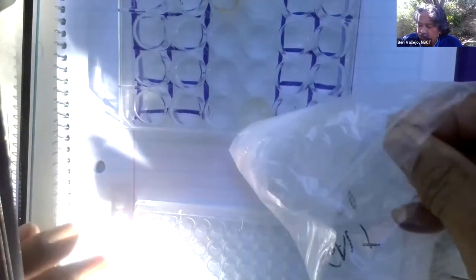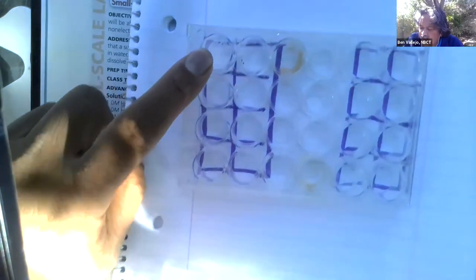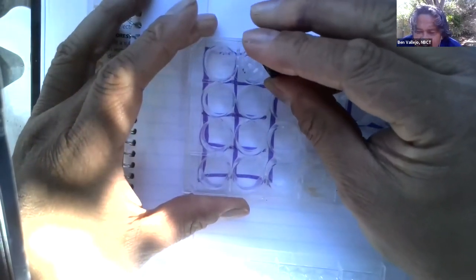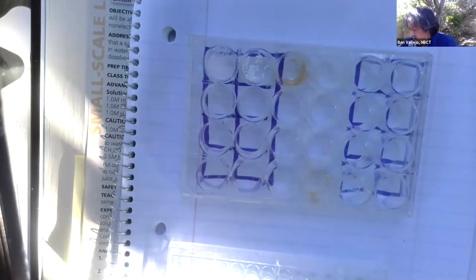So here I am with the salt. The salt goes in the first one. Okay, so I'm gonna put the salt in there. Just a few grains. What did they say? Just a few. Oh, I'm off camera. Okay, so I got some salt in that one right there. What's my next one? Magnesium sulfate. Now, if it's for my kid, I don't really want to pinch it like I did the salt. Okay. That's a few grains, right? But I have to have enough so I could put the tester on it. So that's this next one.